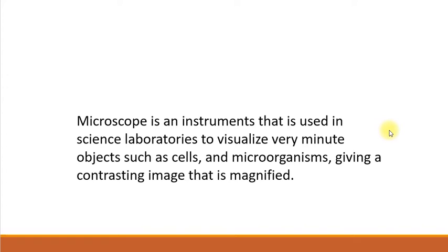A microscope is an instrument that is used in science laboratories to visualize very minute objects such as cells and microorganisms, giving a contrast image that is magnified. Those microorganisms or cells which we are not able to see with our naked eyes, for that we have to use microscopes for magnification.